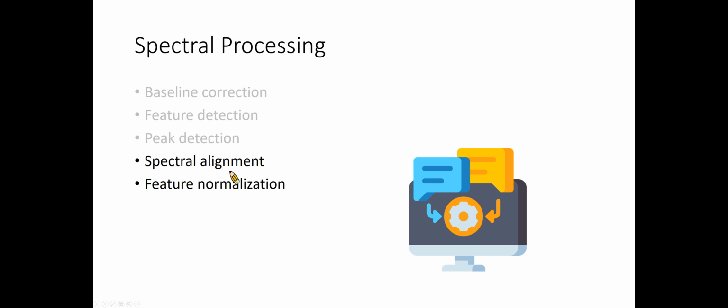quality of the study. Spectral alignment algorithms can be divided into two main groups: spectral alignment methods, where the spectral data is aligned before peak detection, and peak-based alignment methods, where spectral peaks are aligned across samples once they have been detected using their coordinates. We will introduce a useful spectral processing tool for spectral alignment, Skyline Mass, in the later slides.